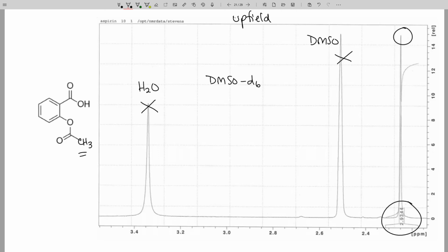This confirms the fact that the compound that we isolated from these aspirin pills is indeed aspirin, and it has a high purity. Now, it's not surprising it has a high purity because it came from a drug. Drugs have high purity compounds, but we don't seem to have a lot of other impurities, and of course nothing bad happened during our isolation process. We didn't destroy our ester or anything like that. So this is good looking stuff.